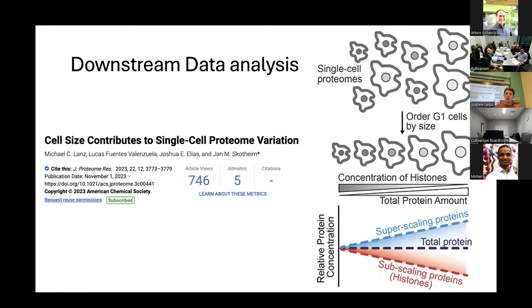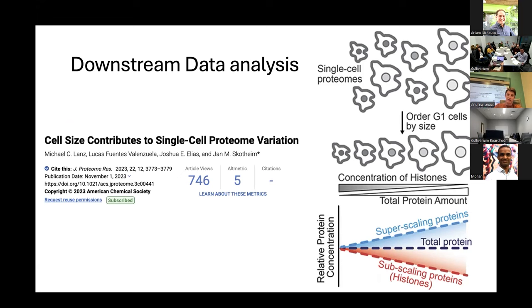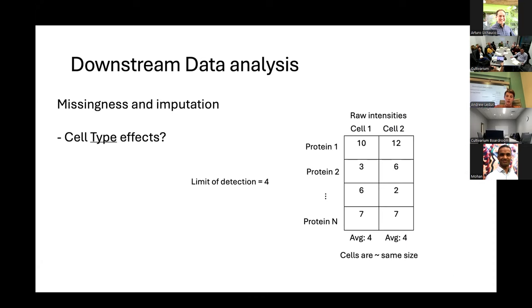So these are, again, I just wanted for computationally minded folks who are interested to work on different avenues for single cell data analysis. This is something that's suboptimal, that someone could come up with a better solution for, that we certainly have not implemented. The other big one, everyone always asks: what about missingness? What about imputation? This is super common.